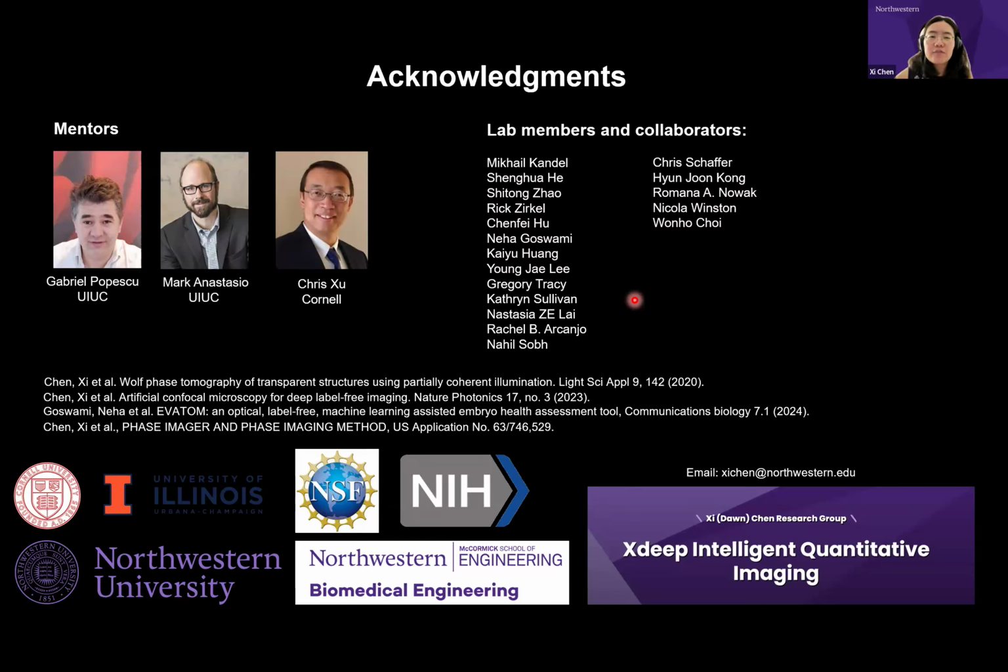That's my guess. I've never tried, but as for the frame rate, it is enough because it's a linear scattering base. We have a lot of photons to image with, and also we have a faster scanner available in the market. Yes. So yeah, that's amazing.